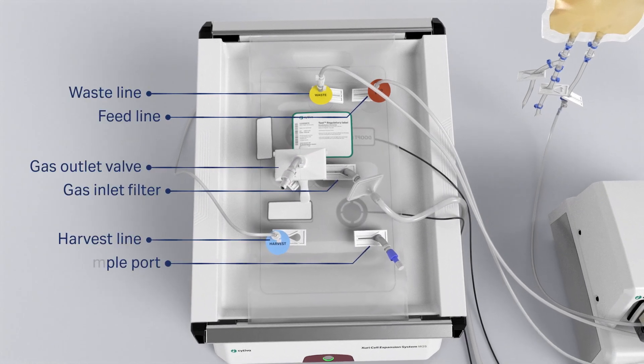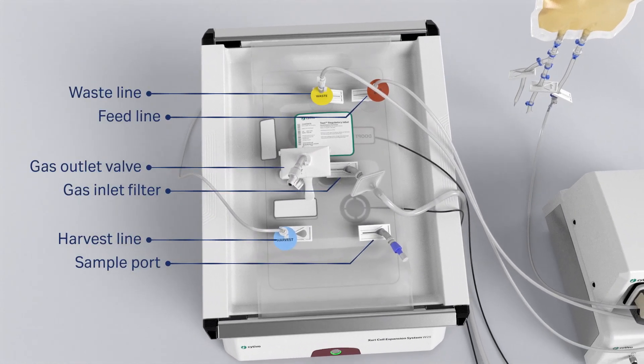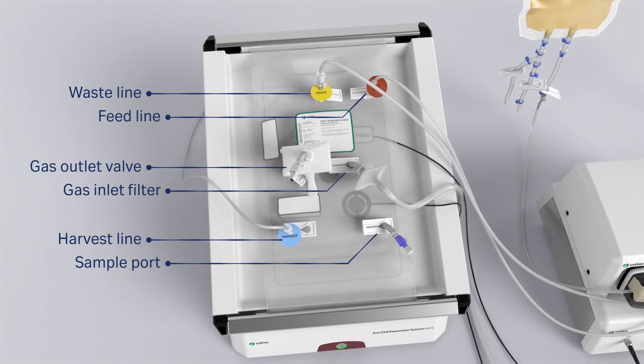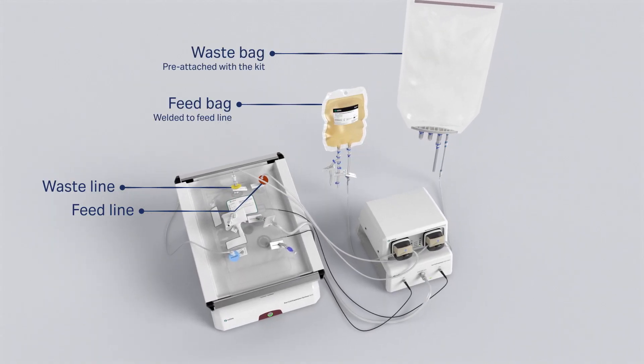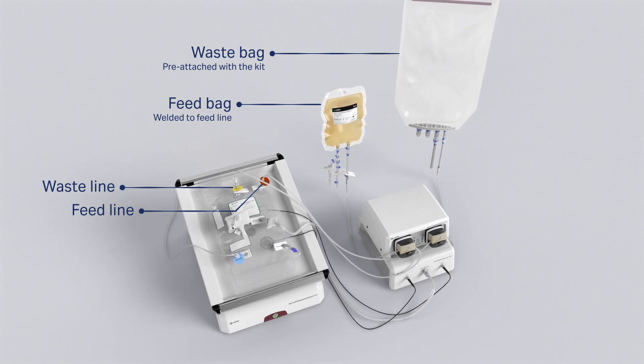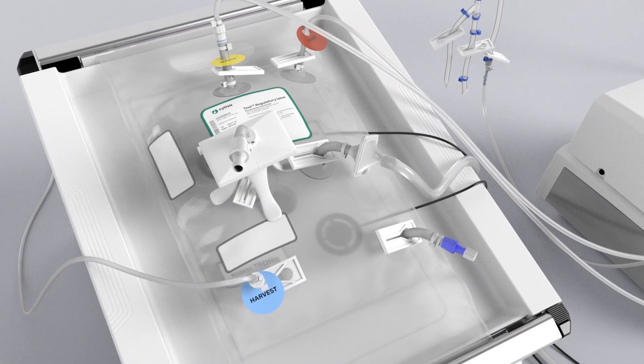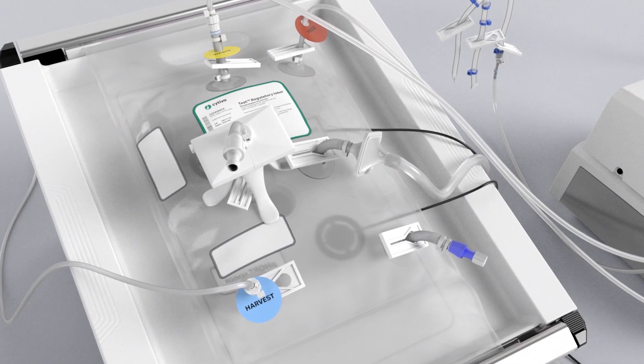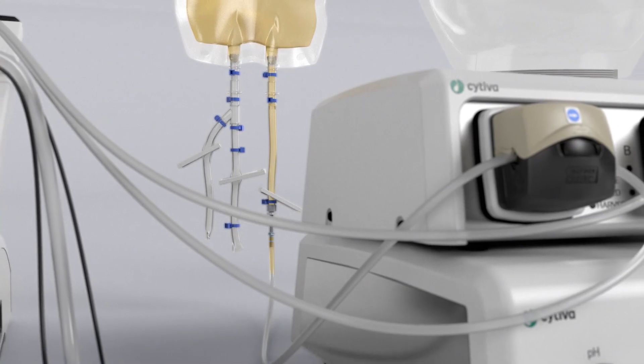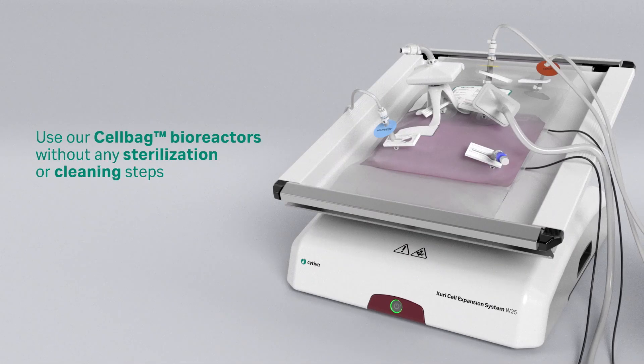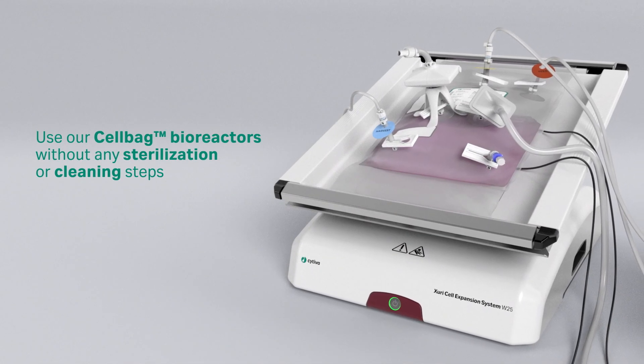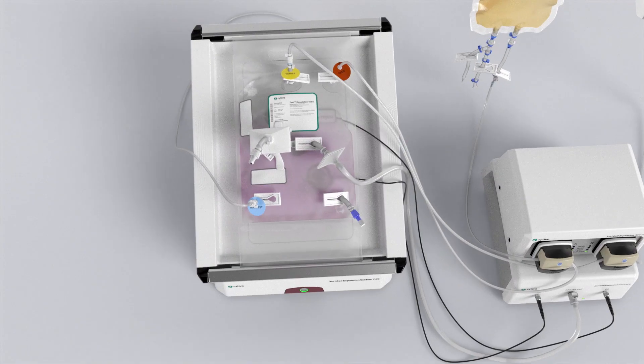All relevant tubing comes clearly labeled and pre-attached to the cell bag bioreactor so you can easily weld media bags and collect waste and used media. The tubing, connectors and clamps help you modulate fluid handling for easy and sterile cell sampling. And you can use our single-use cell bag bioreactors without any sterilization or cleaning steps.